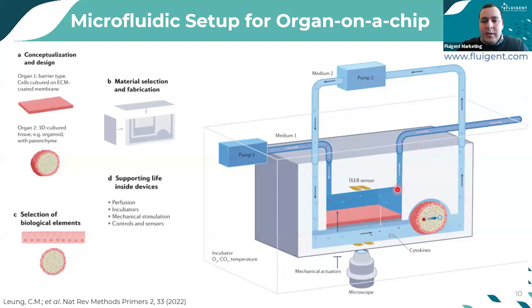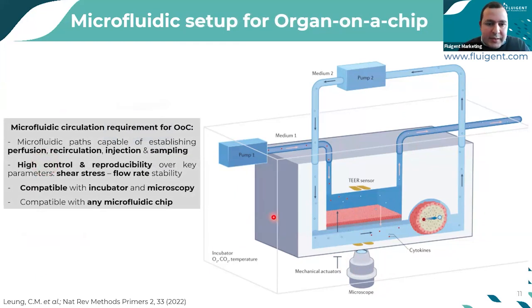In addition, sensors can be coupled, and of course, the microscope in order to monitor what's happening inside. And the best would be to have the whole system compatible with the incubator, O2, CO2, for example, if you are working in a gas environment, and the temperature. So as you can see, there are still a lot of challenges in this field in order to guarantee and ensure the potential of organ on chip.